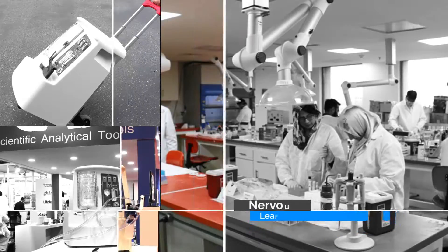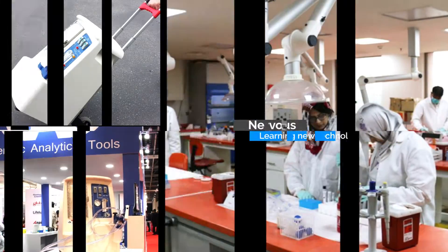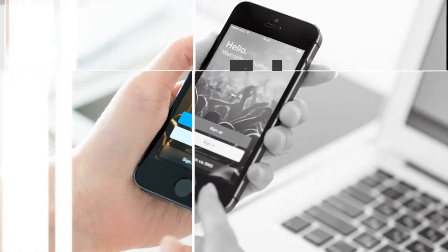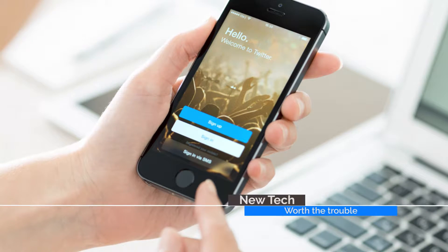People can be apprehensive about new technology, especially when using it for the first time. Do you remember getting your first smartphone? Certainly it's beneficial and capable, but is the payoff worth the trouble? Most say yes.